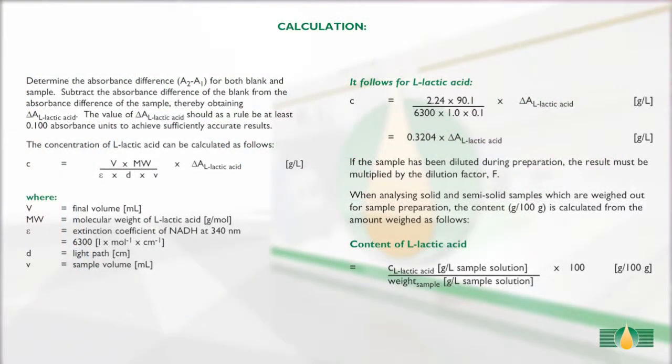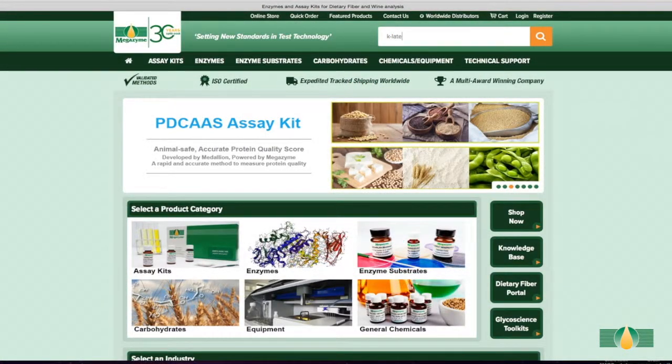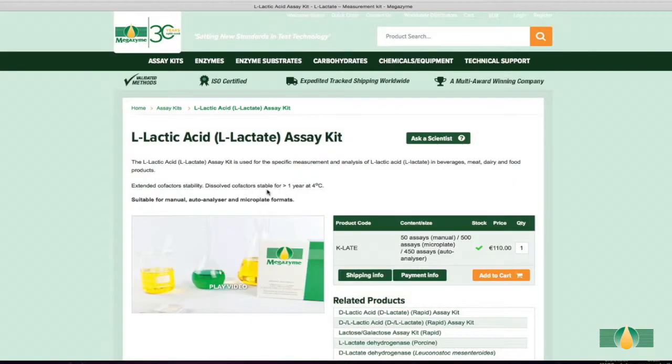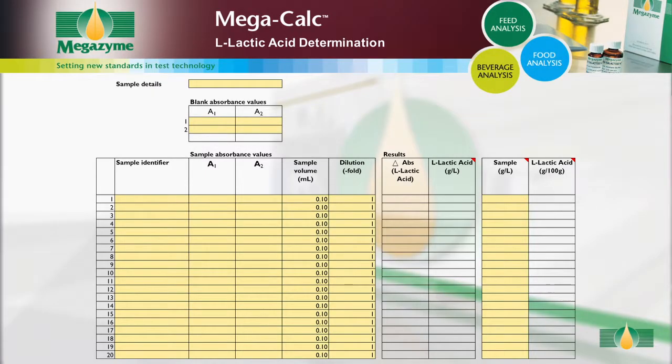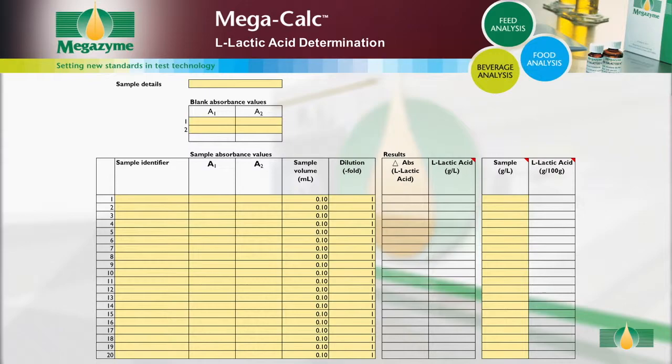Please see our MegaQuantWave video for further details. If the results output are raw absorbance values for both blank and samples, the calculations of L-lactic acid content can be performed manually as described in the calculations section of the kit booklet. MegaZyme has also developed specific Excel-based MegaCalc applications for each MegaZyme kit to allow quick and easy results analysis. Results can be analysed using the MegaCalc application specific to this L-lactic acid kit, which is available to download free of charge from the MegaZyme website. The MegaCalc spreadsheet provides full instructions for use.